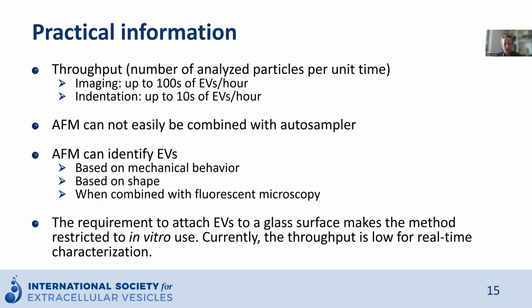The requirement to attach the EVs to a glass surface makes the method restricted to in vitro use. And currently, the throughput is relatively low for real-time characterization, but this is possible.